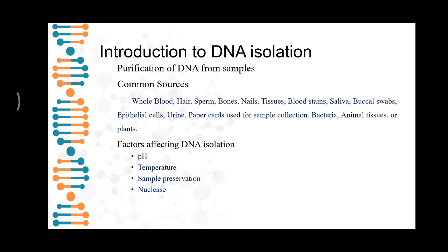Some of the factors affecting the DNA isolation are mainly the pH, temperature, the sample preservation, and nucleases. Any kind of changes within these factors will affect the quality of the DNA to be isolated.